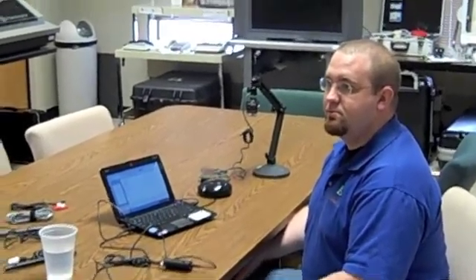Today, we're here with Michael from Independent Science and we're going to talk a little bit about assistive technology or educational technology in the classroom and how that relates to the INDATA Project. So, Michael, why don't you tell us what we've got here on the computer?